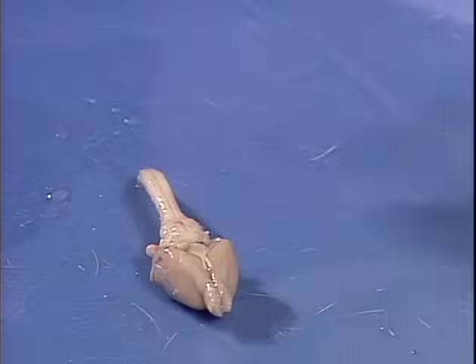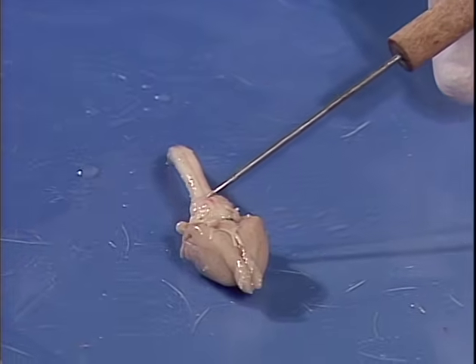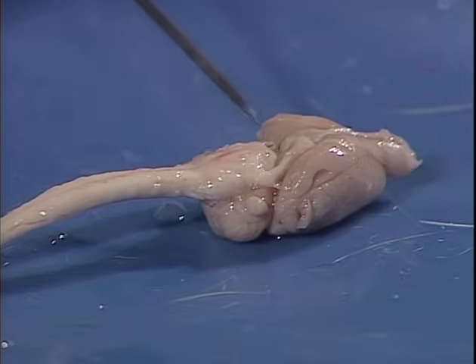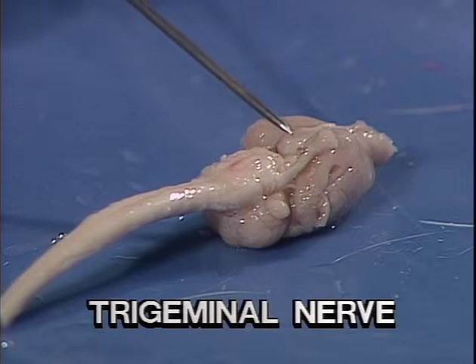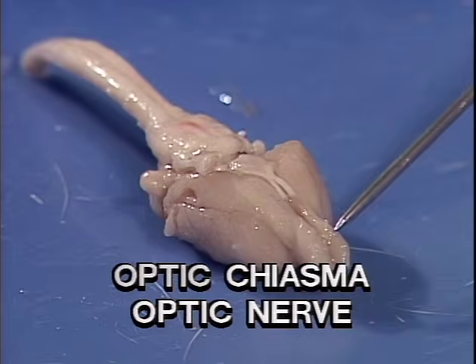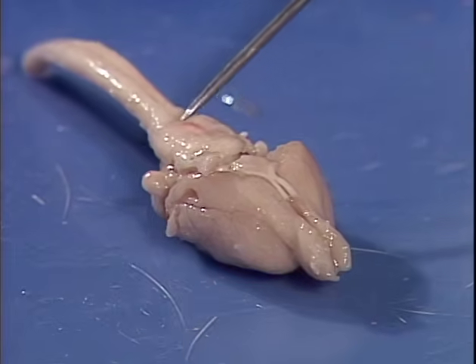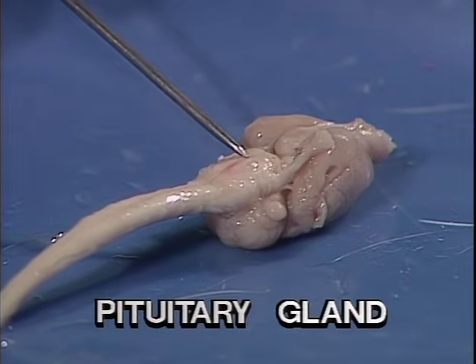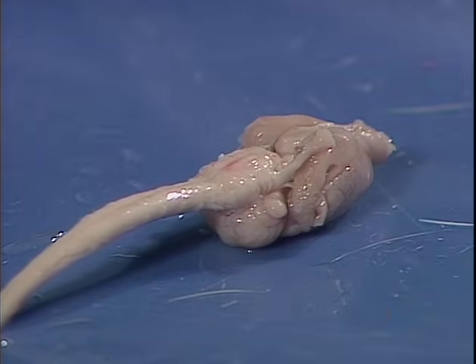On the ventral surface of the brain, we again see the spinal cord, the medulla oblongata, the paraflocculus of the cerebellum. This is the trigeminal nerve. Here is the optic chiasm and the optic nerves, olfactory lobes. Located in this area would be a reddish gland that hangs down from the brain, which is the pituitary gland. This concludes the nervous system of the rat.